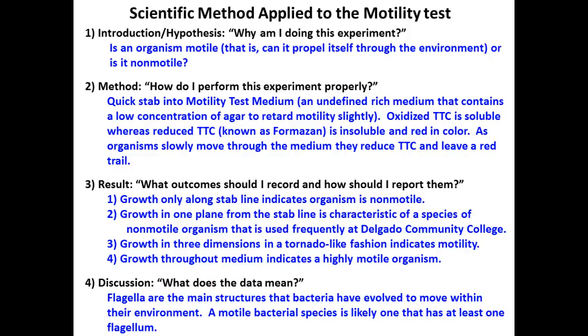Flagella are the most common way in which bacteria are motile, but it's not the only way that they're motile. But I can say for a fact that the ones that we're utilizing in this lab have flagella. That's how they're motile. We don't have any spirochetes. Remember, those can corkscrew through. We're not working with any of those.